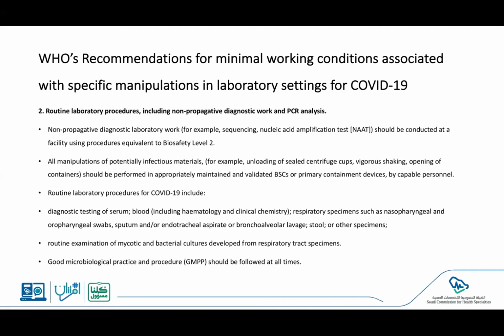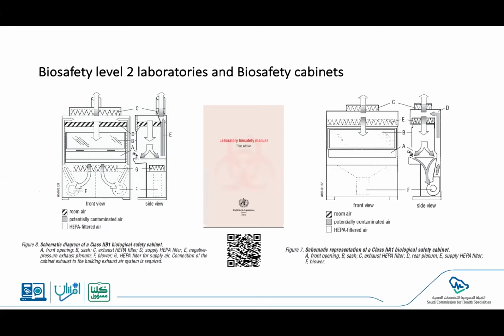And of course, it's very important for us to consider practicing, as I mentioned, good microbiology practice procedures throughout any of these practices. And even if you receive requests for conducting culture, for example, for sputum, for patients that are suspected of having COVID-19, again, they need to be treated as suspected COVID-19, which means they need to be processed inside a biosafety level 2 laboratory and biosafety cabinet. So biosafety level 2 laboratories have specific requirements associated with the biosafety cabinet. There are mainly two different biosafety cabinets. The class 2 biosafety cabinet A, whether A1 or A2, and then we have class 2 biosafety cabinet B1 and B2.